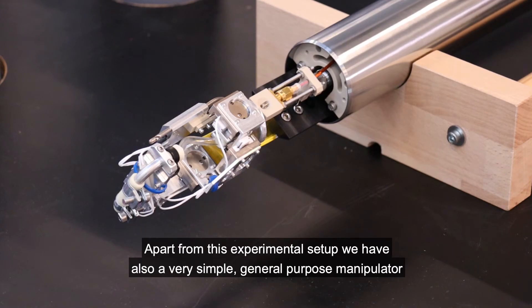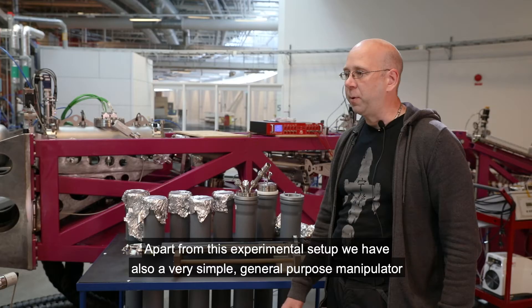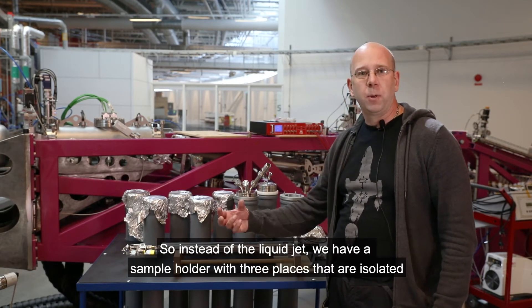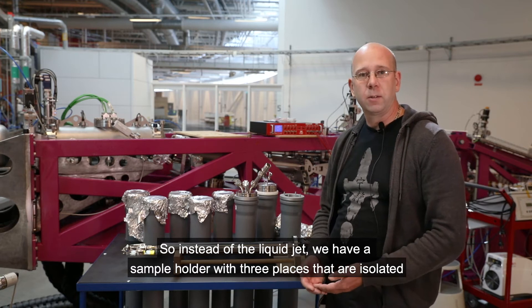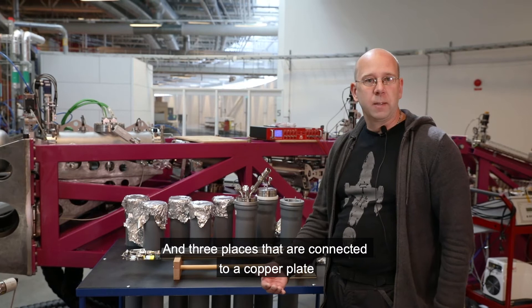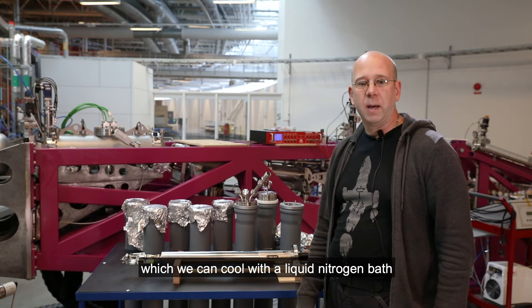Apart from this experimental setup, we also have a very simple general-purpose manipulator. Instead of the liquid jet, we have a sample holder with three places that are isolated so that we can measure drain current, and three places that are connected to a copper plate which we can cool with a liquid nitrogen bath.